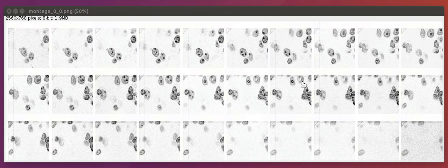So if you've done any of the previous cell segmentation jobs, then you'll know how to deal with images like this one in the center, where if you have here 1, 2, 3, and 4 cells that are right next to each other, you would label them cell 1, cell 2, cell 3, and cell 4. And you should continue to do this in this job, but what you should recognize is that, one, these cells are going to exist in multiple frames. So if we were to say this one here is cell number 2, then it should be labeled cell number 2 in this frame, in this frame, in this frame, and so on.